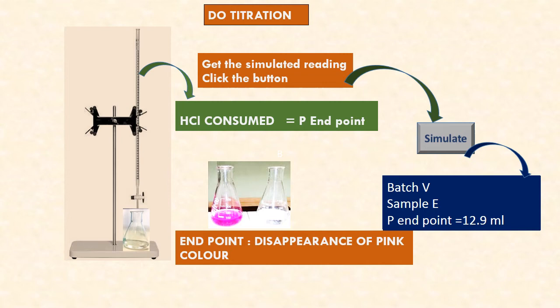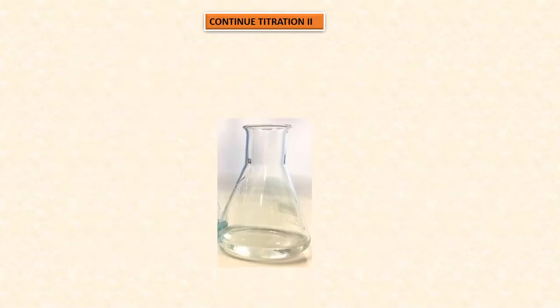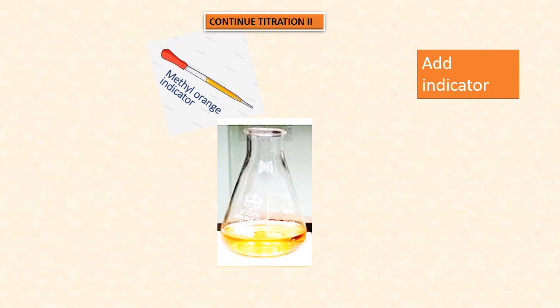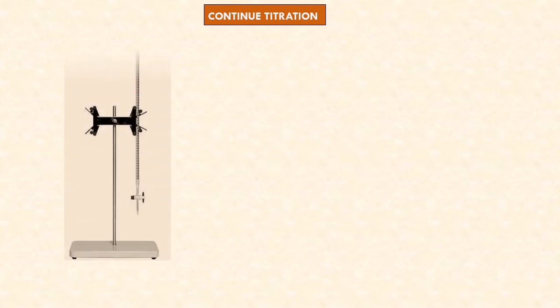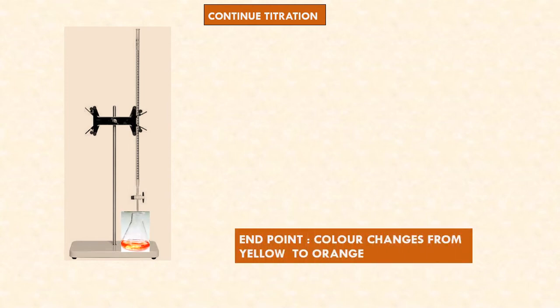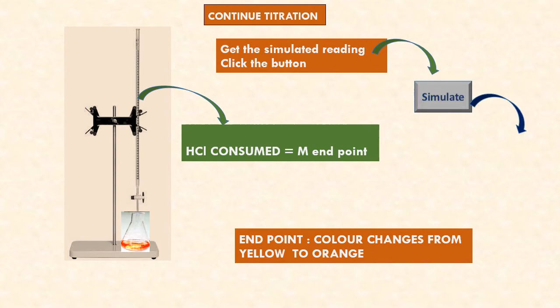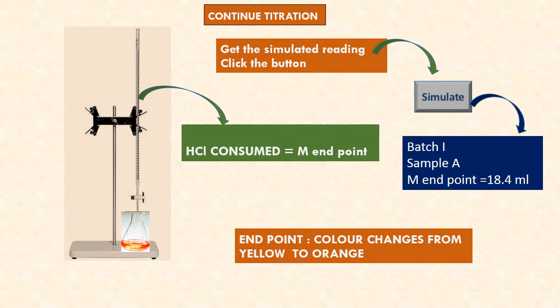Now, for all five samples, we continue the titration by adding methyl orange indicator to the same solution. Upon adding methyl orange indicator, the solution turns yellow. Continue titrating with HCl solution — the yellow color turns orange; that is the endpoint. Note down HCl consumed as M (methyl orange endpoint). Batch one, sample A: methyl orange endpoint is 18.4 ml.